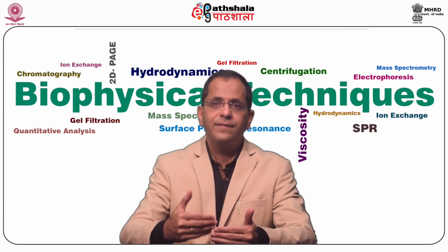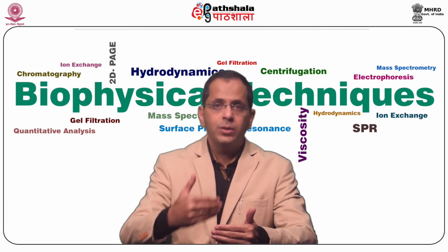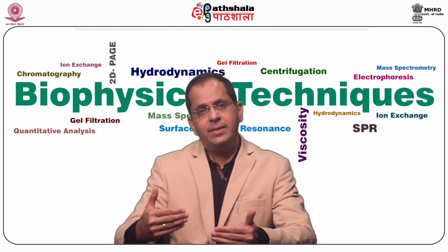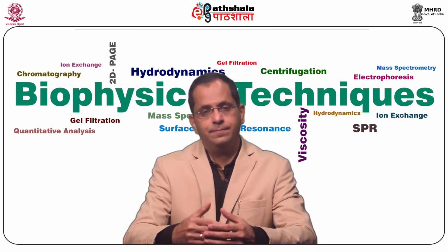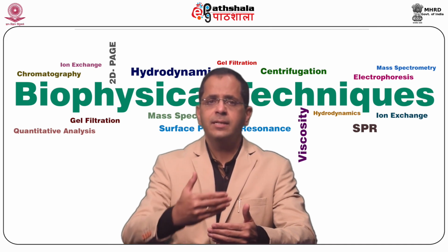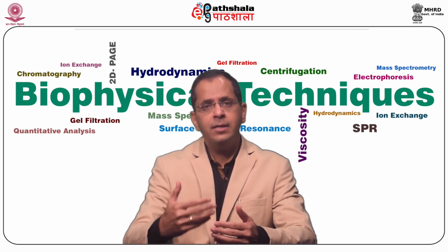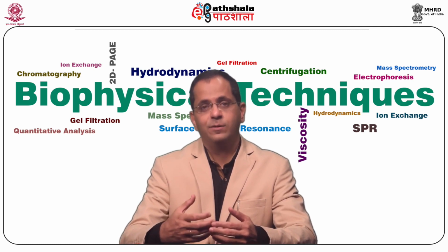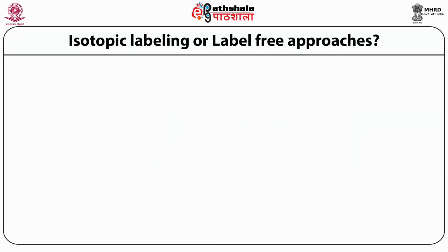The chromatographic separation between the two runs needs to be controlled to quantify the MS-MS identified peptides. This particular workflow is applicable only to high resolution mass spectrometry based platforms. Isotopic labeling or label-free approaches. First, we will discuss isotopic labeling.